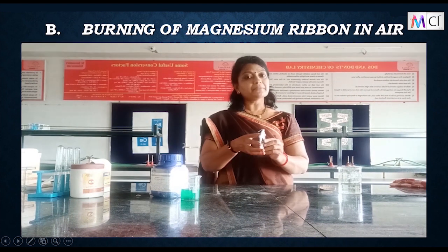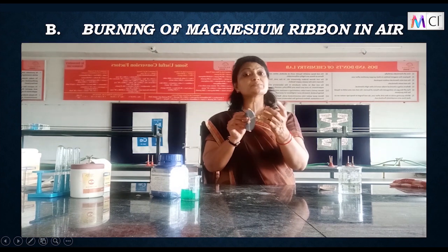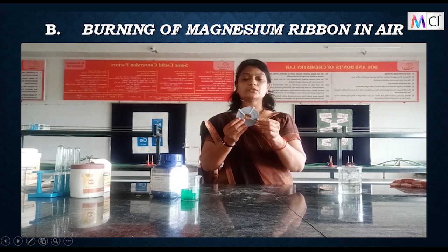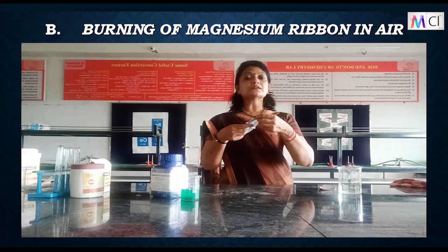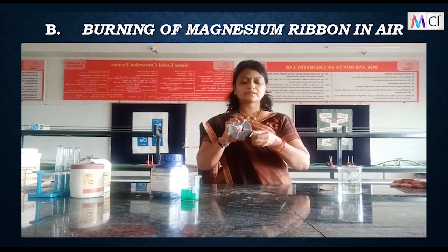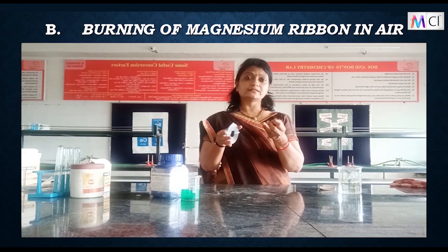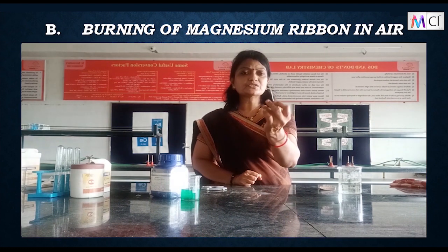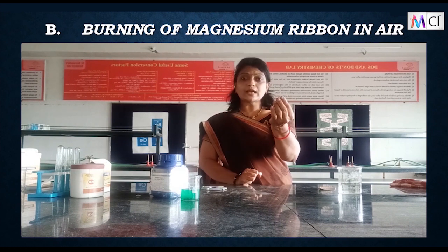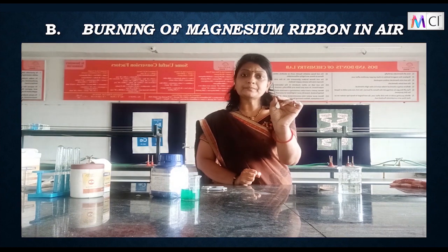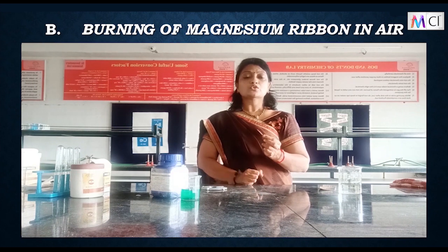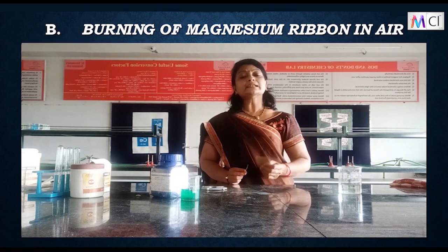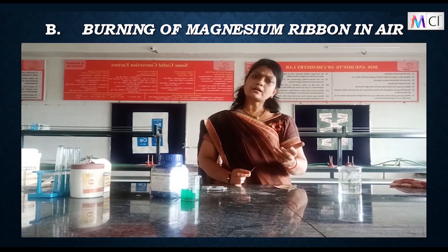Next we have the magnesium ribbon. Magnesium is a metal and, as metals are malleable, it can be made into thin sheets. It undergoes corrosion very fast, forming a magnesium oxide layer which gives it a dull appearance. We need to take sandpaper and scrub it to remove the oxide layer and expose the magnesium metal, and then we will burn it to see whether a chemical or physical reaction has taken place.